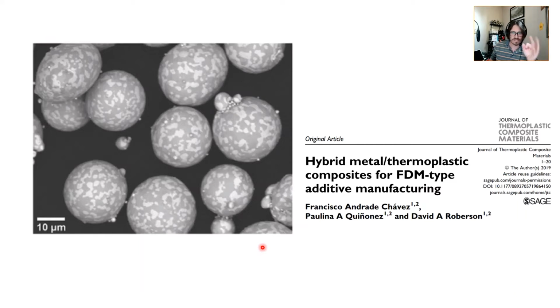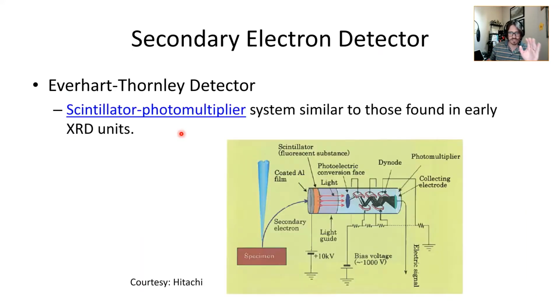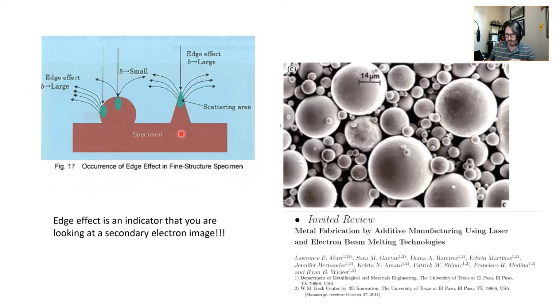And I have had several arguments with people basically telling me you cannot see holes on a scanning electron micrograph, like literally a hole. If I have a flat substrate that has a hole in it, people have told me you can't discern it. That's incorrect. You have to know what signal is generating your image, and then you can determine if it's a hole or if it's just chemistry related in terms of contrast. Because remember, a lot of looking at micrographs, even colorized micrographs, is still about looking at contrast.